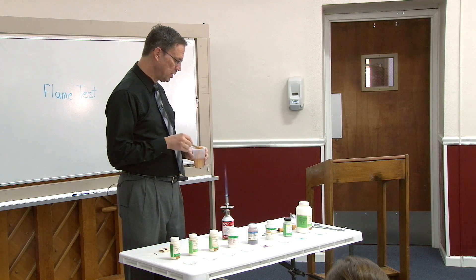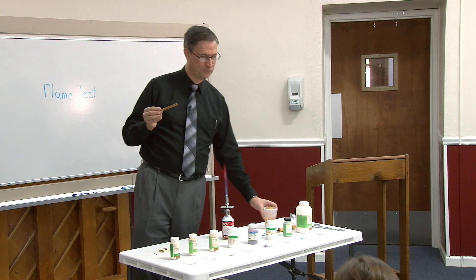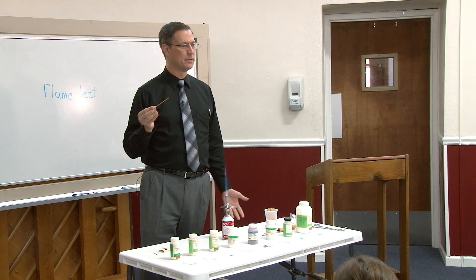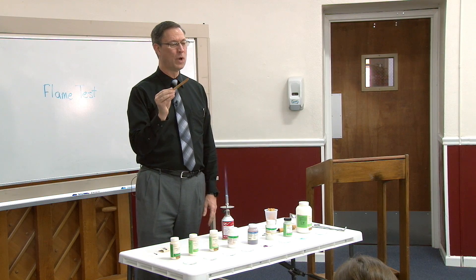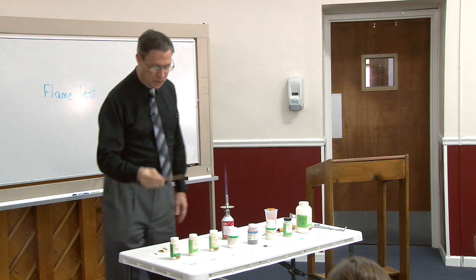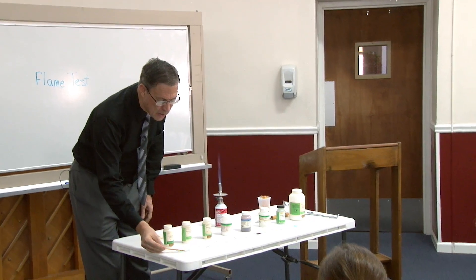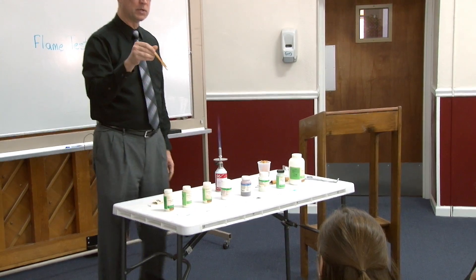These are popsicle sticks that I put in water overnight. Does anybody know why I put them in water? So that the stick doesn't burn — if it's wet, it won't burn. Also, if it's wet, when I put it into the powder here, which is laying in these little watch glasses, it will allow the powder to get on there.